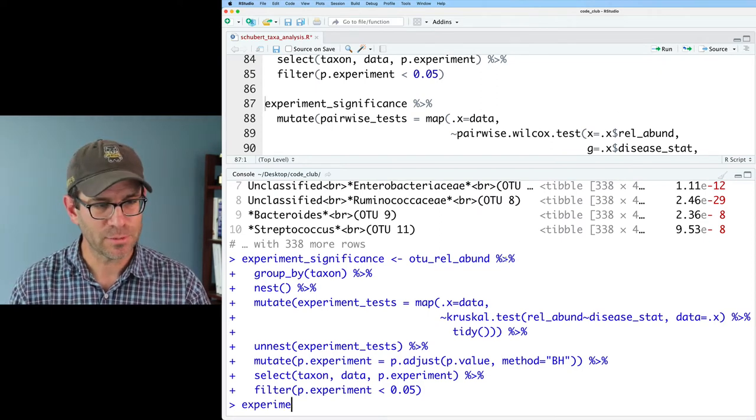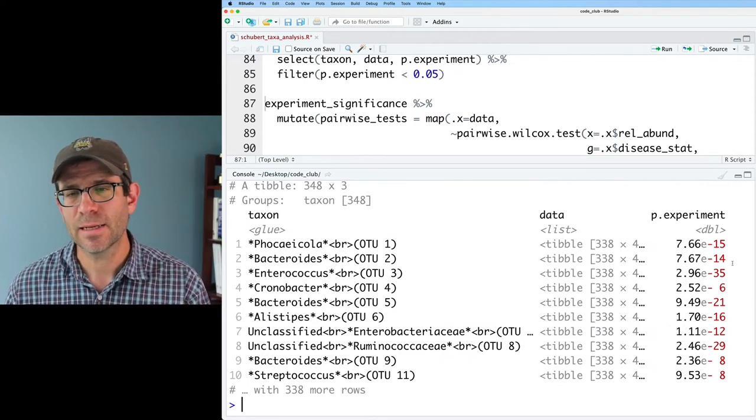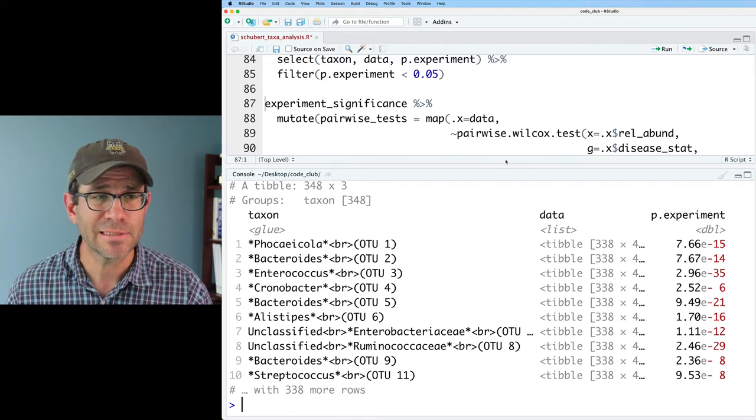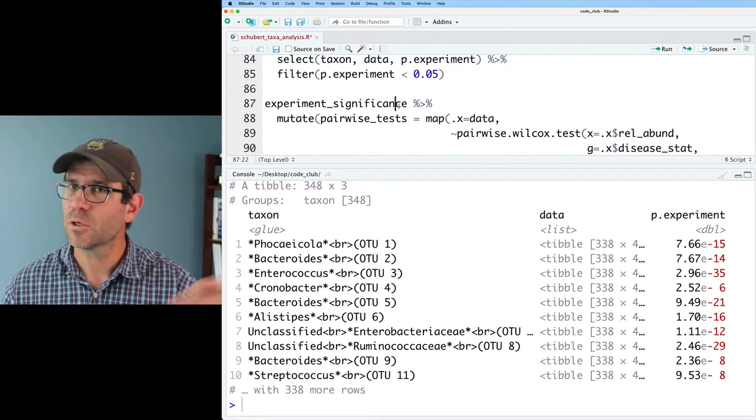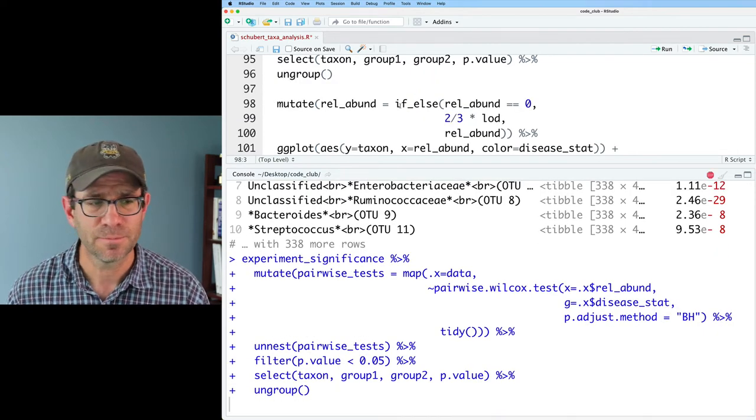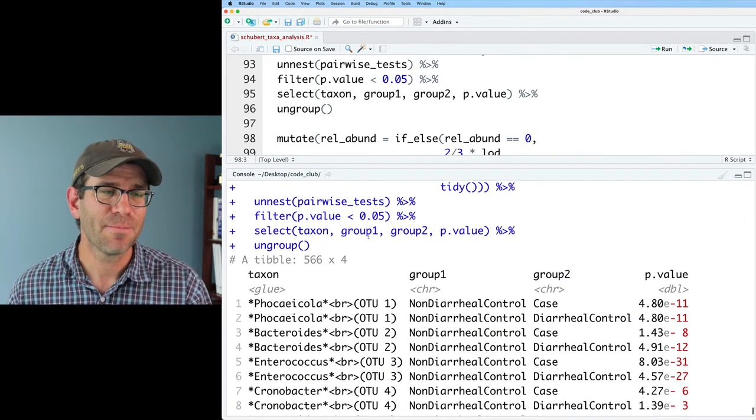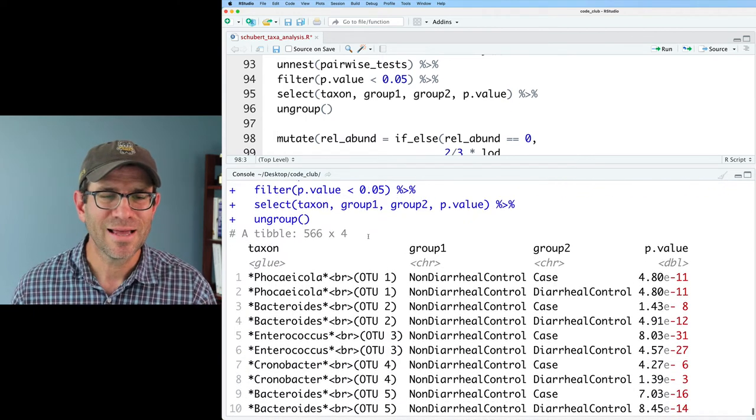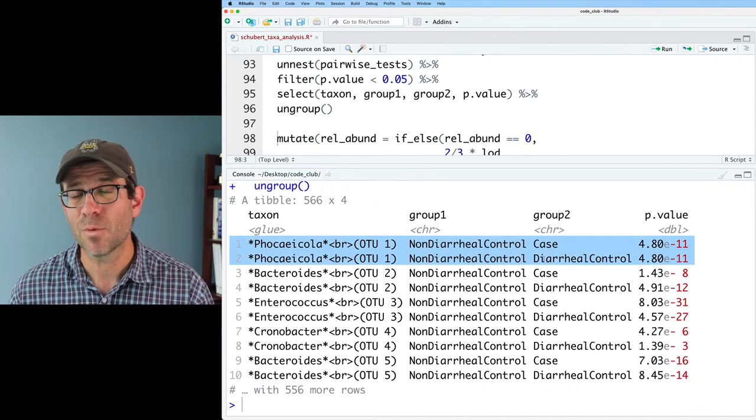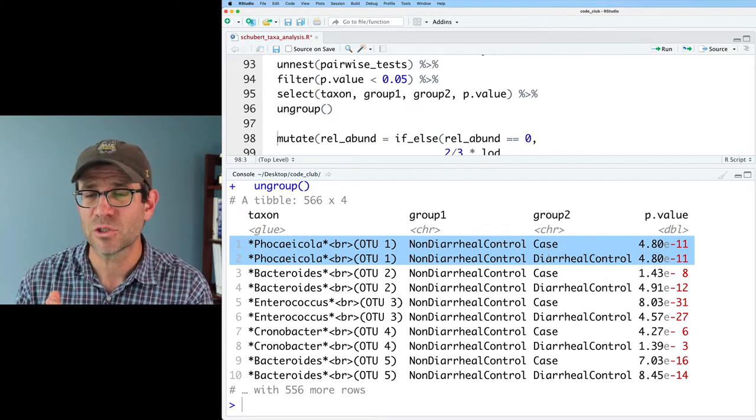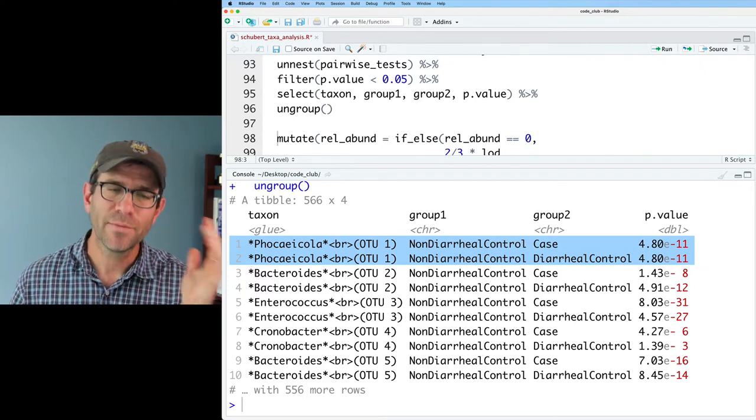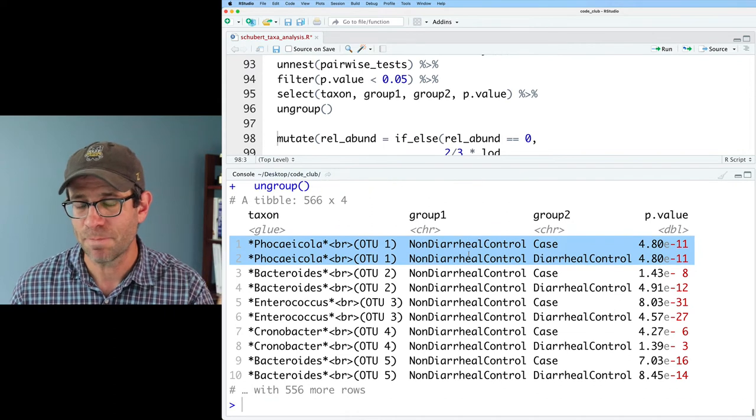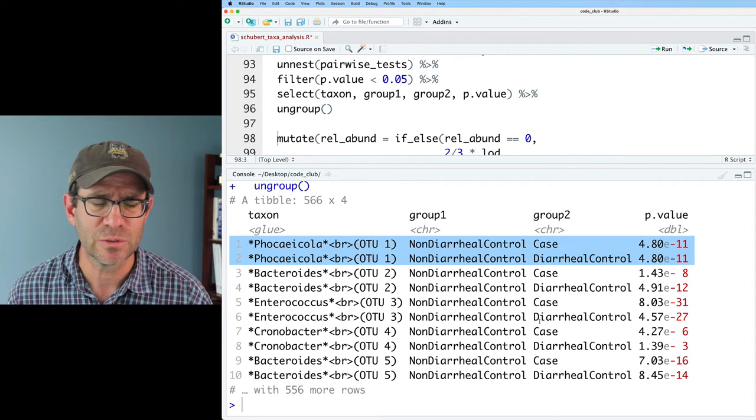So that took a moment or so to run. And if we look at experiment significance, we then see there's 348 OTUs that had a significant p-value after correcting for multiple comparisons. This then could be fed into the next stage of doing those pairwise Wilcoxon tests to figure out which comparisons were significantly different from each other. And here we see 566 pairwise comparisons that were significant. It's not quite double what we saw. I think for the most part, based on what we saw in the study is that the diarrheal samples, so the case and diarrheal control are generally not significantly different from each other, but they are going to be significantly different from the healthy individual that didn't have diarrhea. And so we kind of see that really for most of these OTUs.